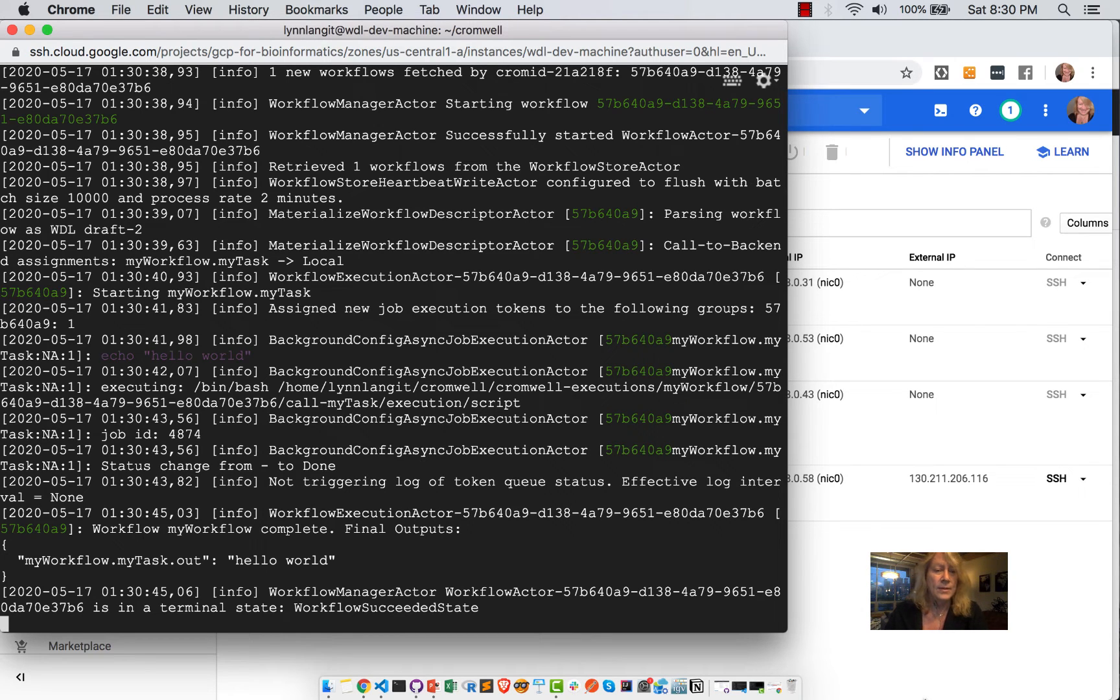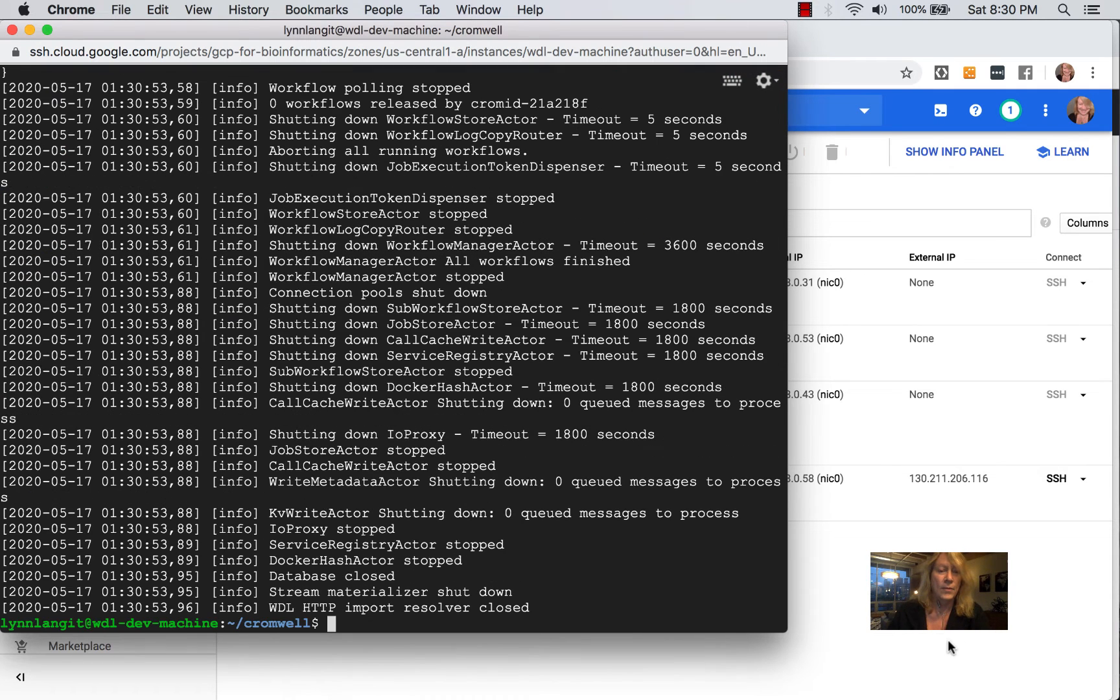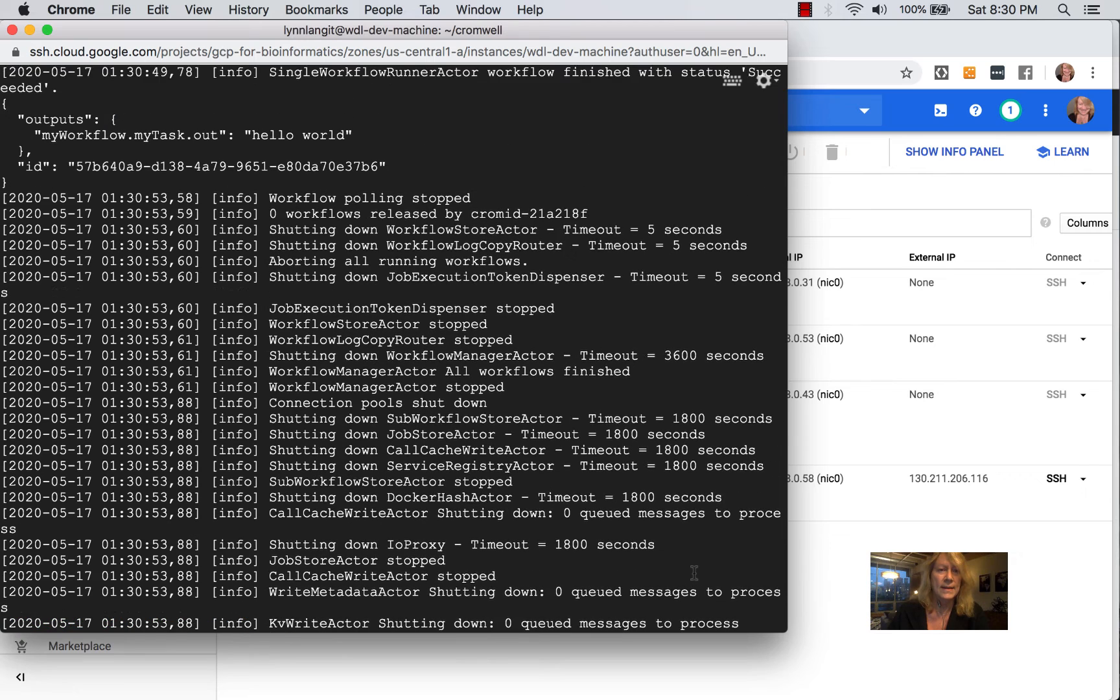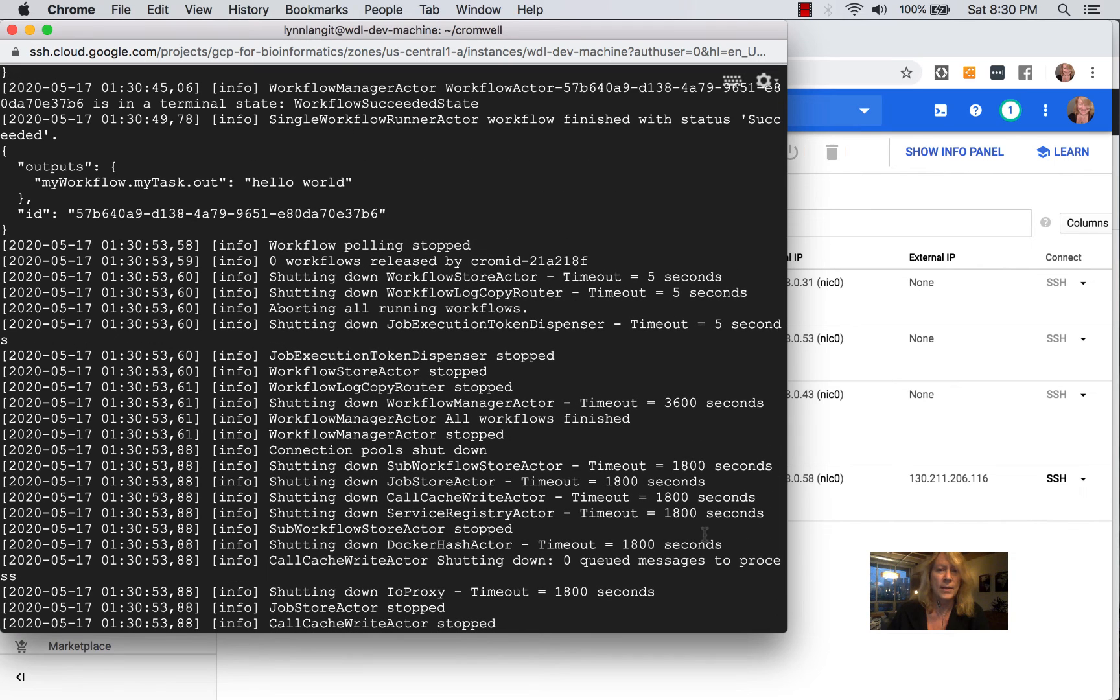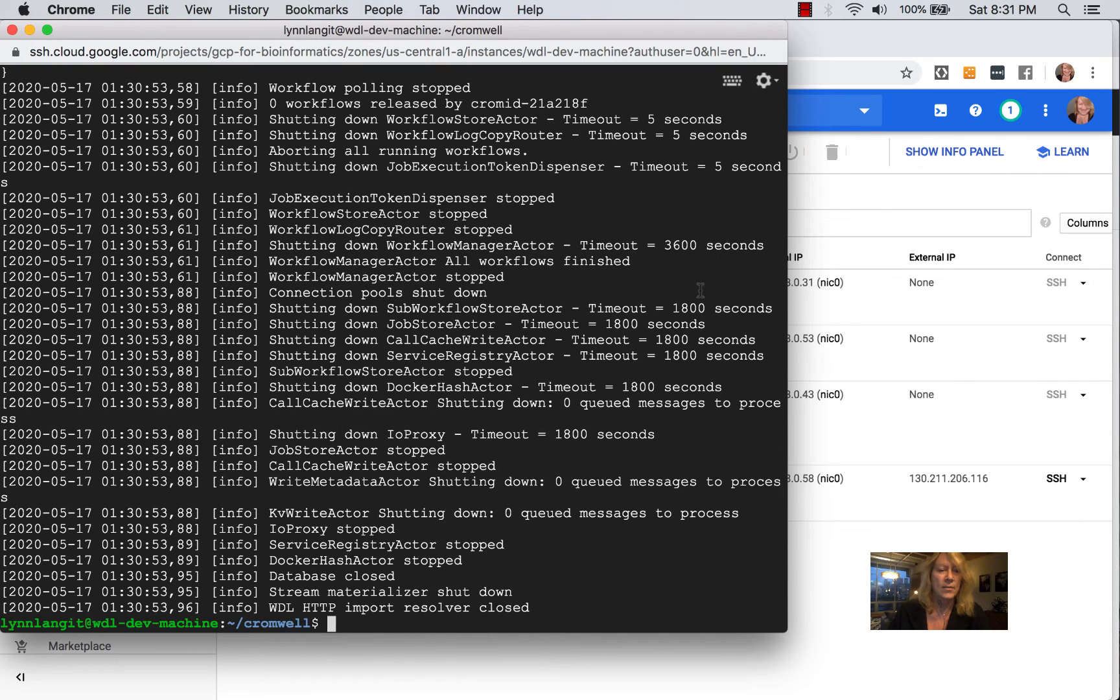So you can see that I have the output of hello world and the workflow finished with success. Here I'll show you where that is. Right here, status succeeded. And there's the output. And then it shut down.